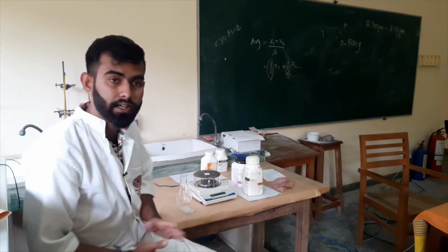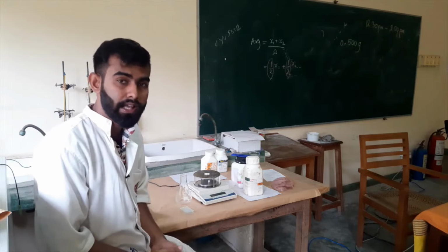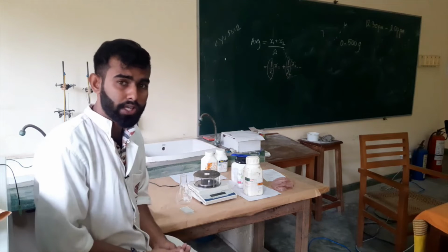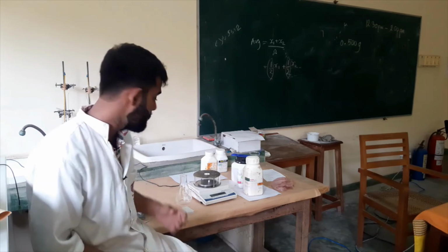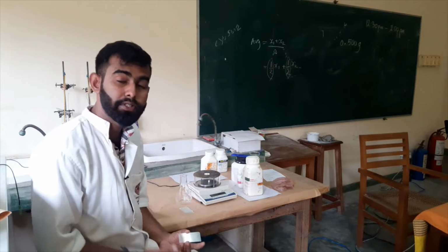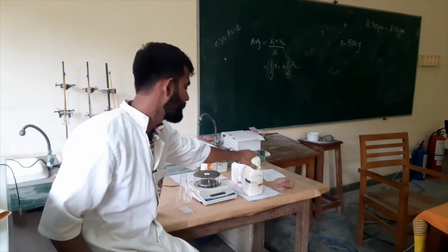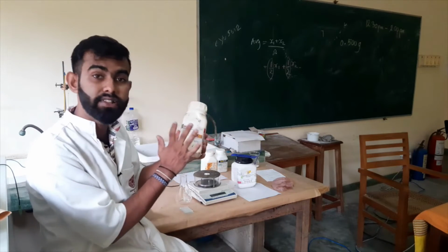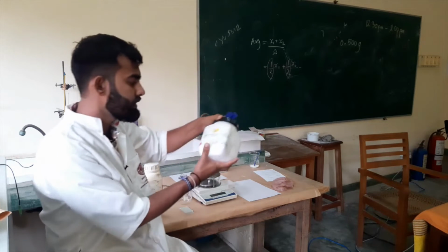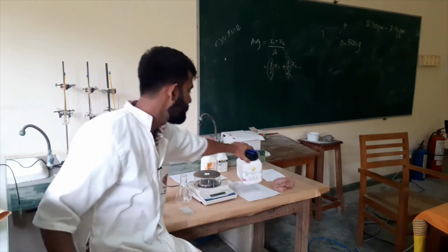In the TLC technique, we usually use silica gel as our stationary phase. As you desire, you can choose the mobile phase. However, in the stationary phase, we use silica gel. There are two types of silica gel. Here I have silica gel G60, and here I have silica gel GF254.